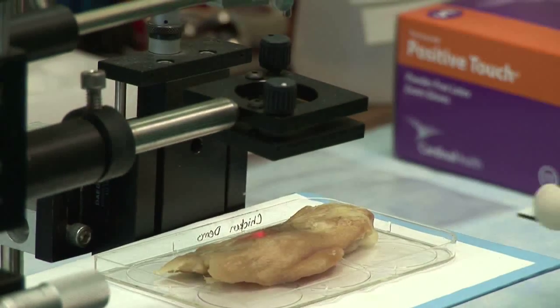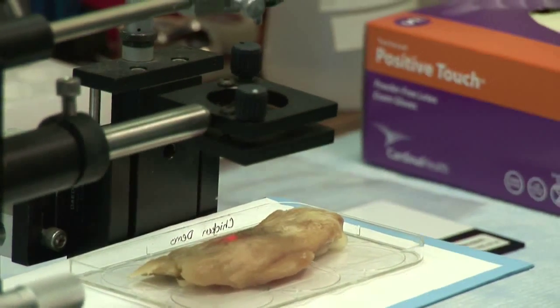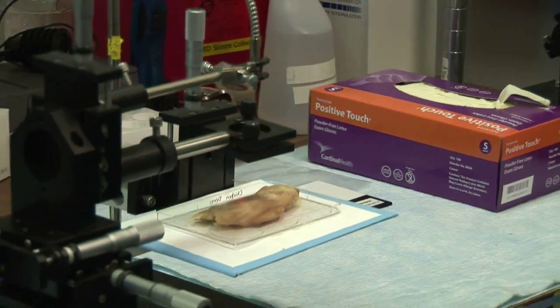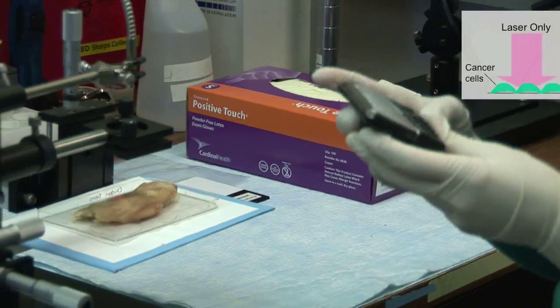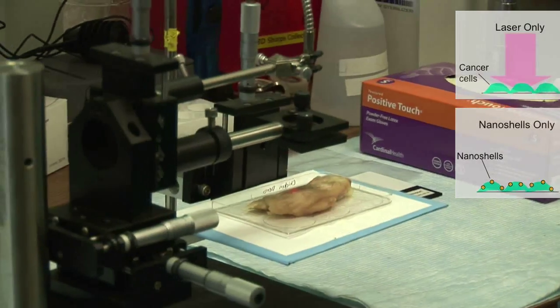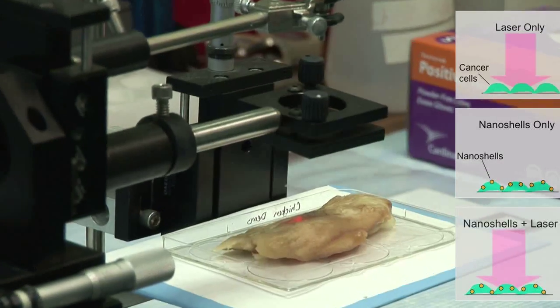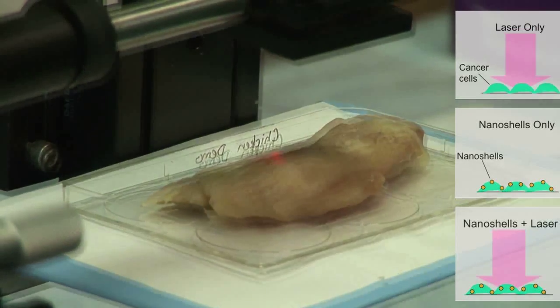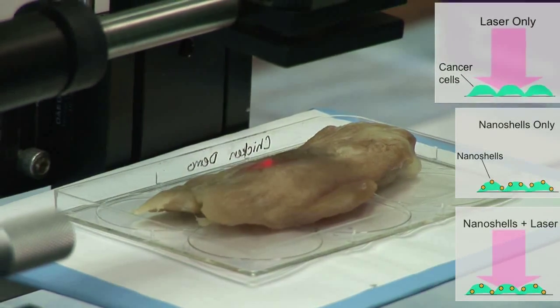I'm going to go ahead and start my timer and let it run for 30 seconds. So once we've done that, I'll take this solution of nanoshells and inject a little bit into the tumor. It's been 30 seconds and nothing has really happened, so we're going to turn this off.